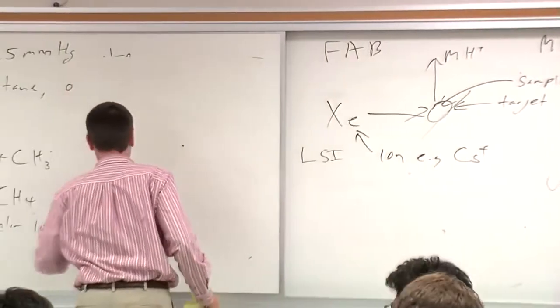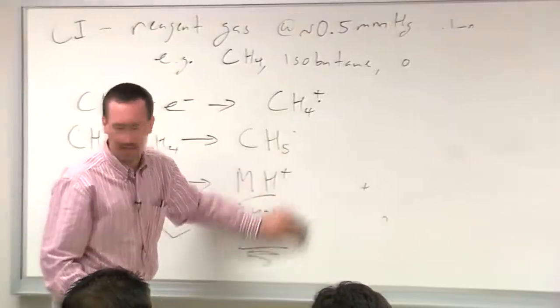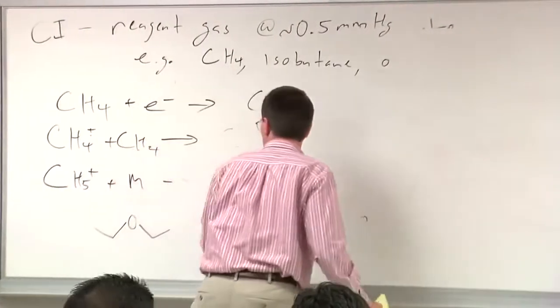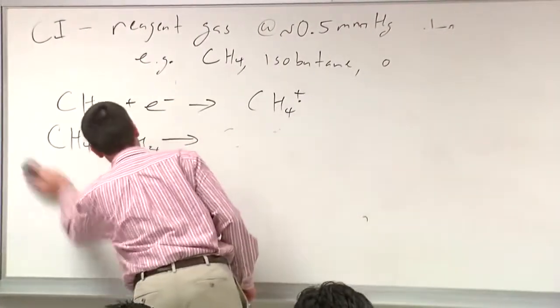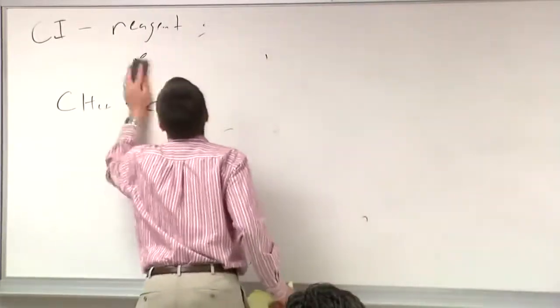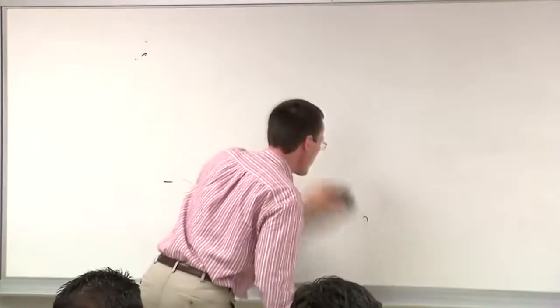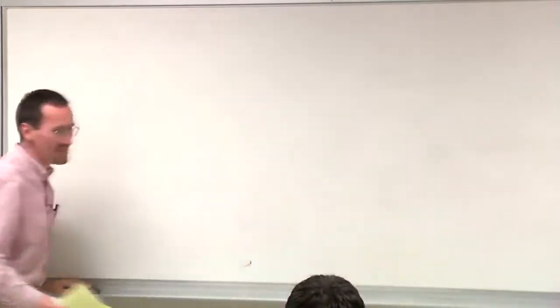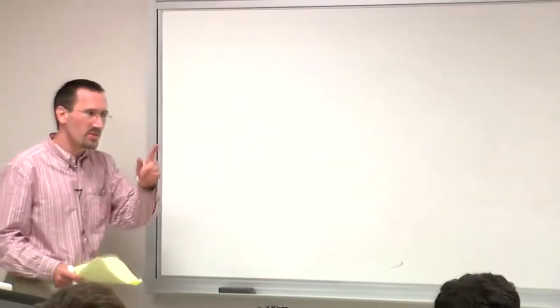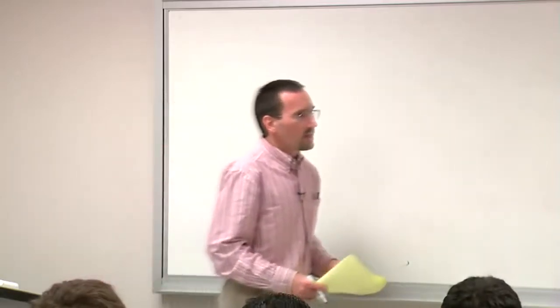Is that for the fast atom bombardment? For fast atom, well, both of the techniques, but fast atom was the one that first was popularized. John Greaves does the LSI technique. And again, I'm sure he will wax poetic on the differences between the two techniques, but for your purposes, they're pretty similar.